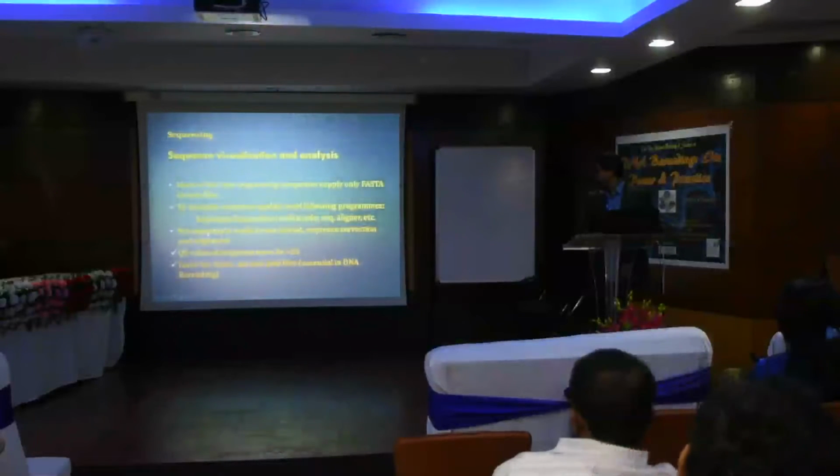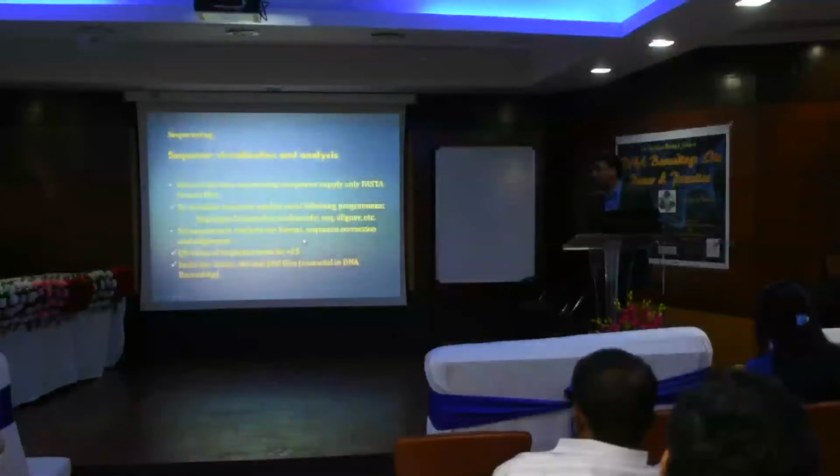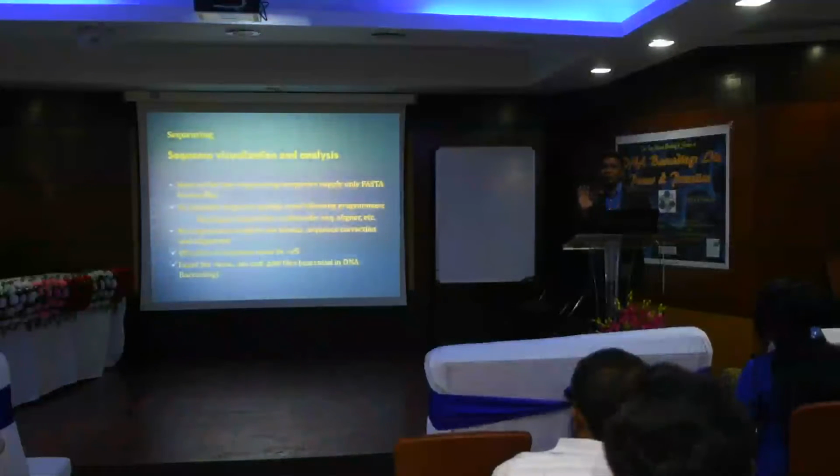assignment. No sequence is in a ready-to-use format. Sequence correction and alignment are essential. No machine in the world will give a good sequence. Even with NGS, they are not ready-to-use sequences. You need to go and annotate them. You need to make manual corrections to any type of sequence.